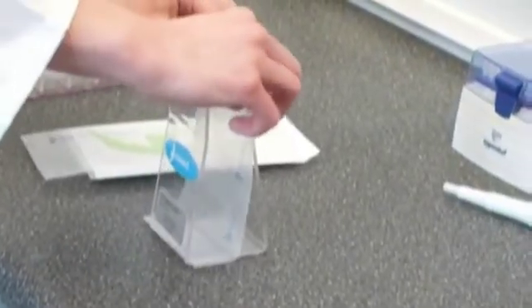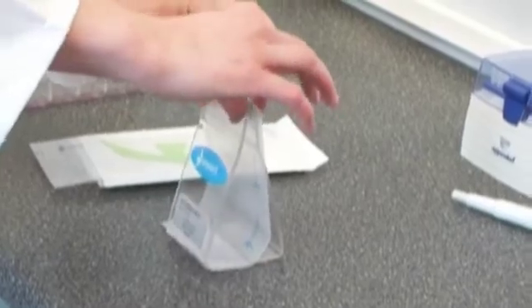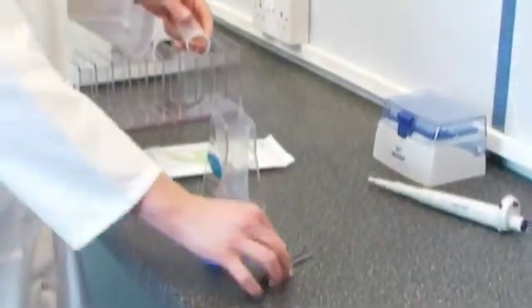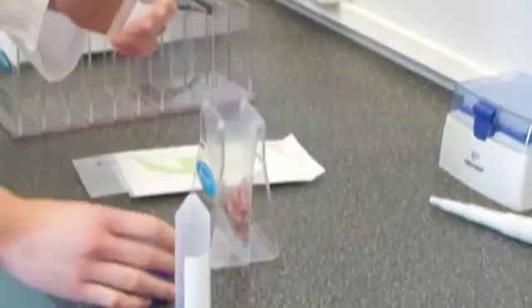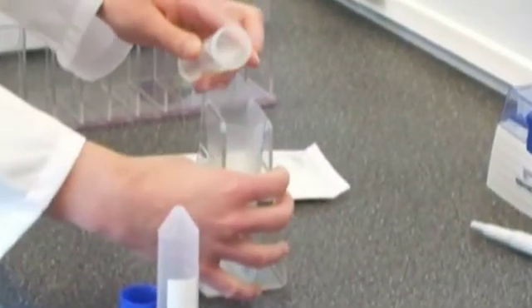The Stomacher 80 Biomaster is ideal for small samples and tissue processing. It is capable of processing samples from 5 to 80 millilitres. A wide range of Stomacher 80 bags and accessories are also available.